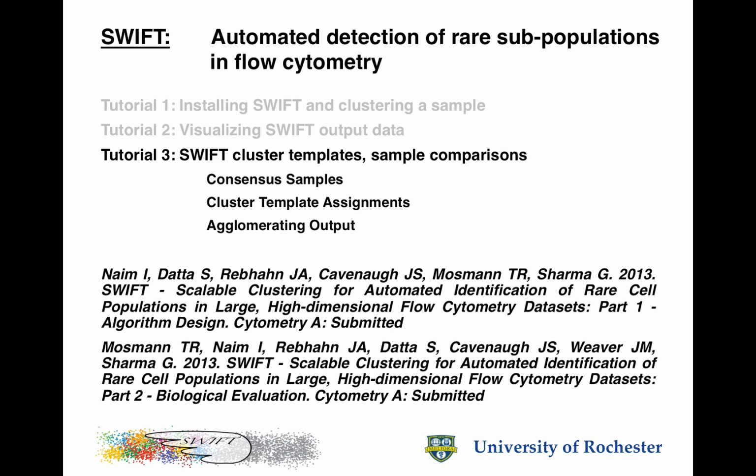In this tutorial, we will explain how to compare samples, first of all making cluster templates that can be used for multiple further samples, making those from consensus samples, then assigning samples to those cluster templates, and finally putting together the output into usable tables of large-scale data.